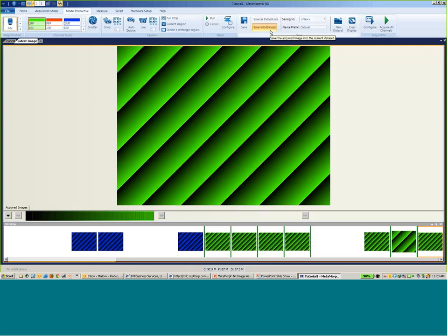So I can do some analysis on other data sets that I have acquired while I'm running through a new experiment acquisition. I don't have to wait for this to end before I can do something on a previously acquired data set. So that is definitely pretty nice, having that ability to multitask a little bit and not just freeze the system while the acquisition is going on. Okay, so I'm going to stop this because we really don't need to go beyond that.